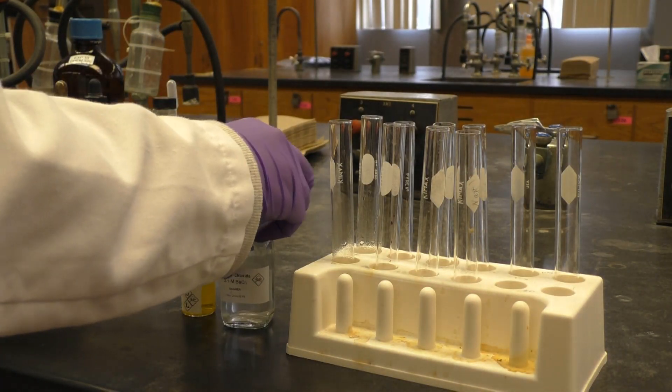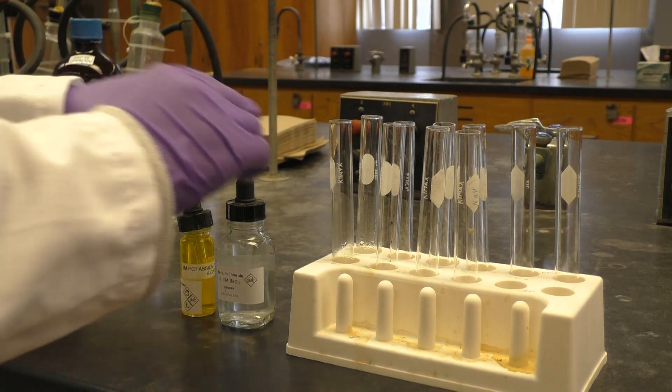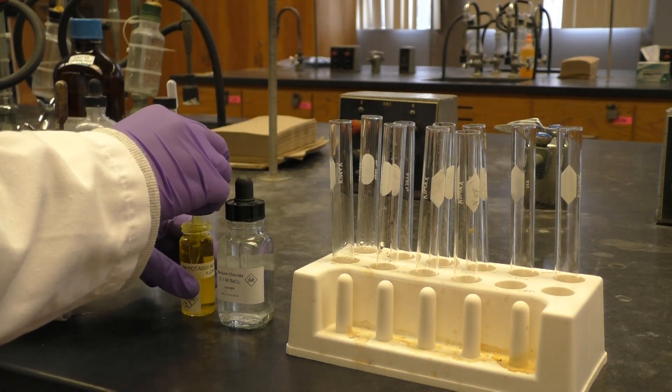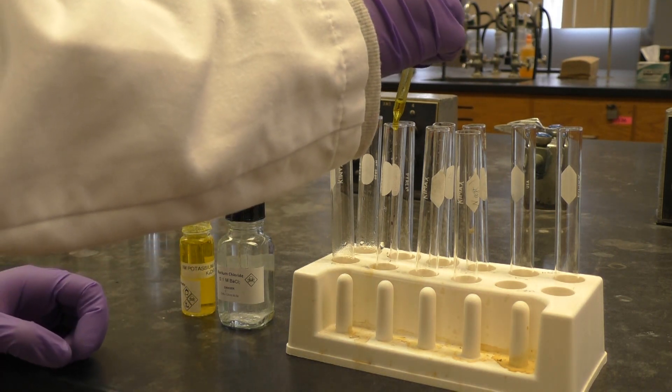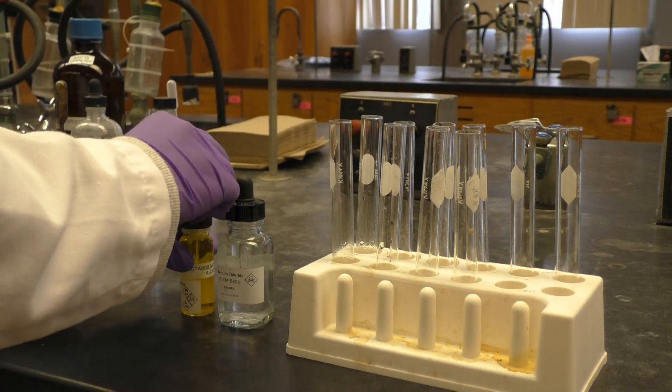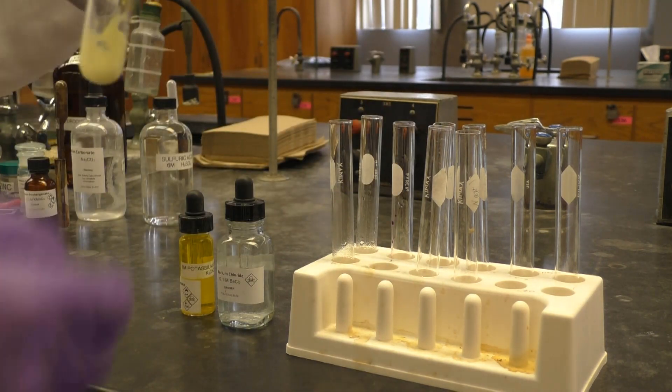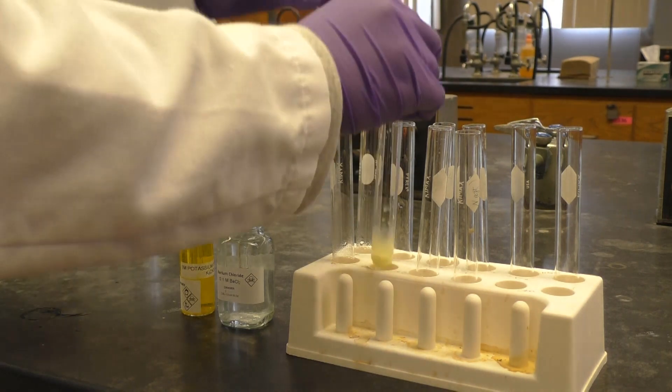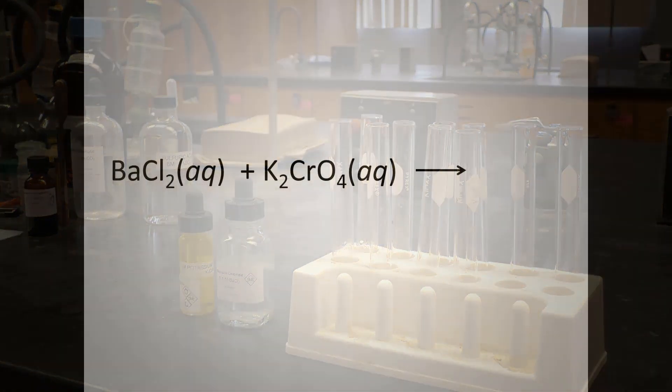On to the metathesis reactions. First, we'll show one that forms a solid product, thus this is known as a precipitation reaction. We are adding one milliliter 0.1 molar barium chloride to the tube, followed by two drops of one molar potassium chromate. We see a solid forms in the tube. What could that solid be? Refer to table 5.1. Could it be barium chromate?